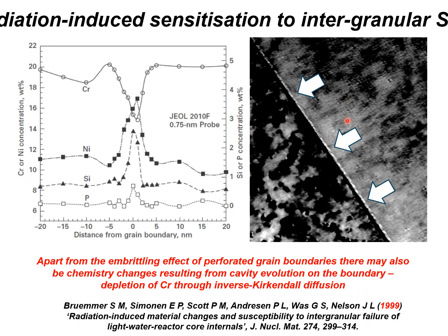And the diffusion of vacancies to the bubbles gives you a chromium depletion. So it's local diffusion of vacancies to the bubbles. And that's because chromium is a fast diffuser by a vacancy mechanism.